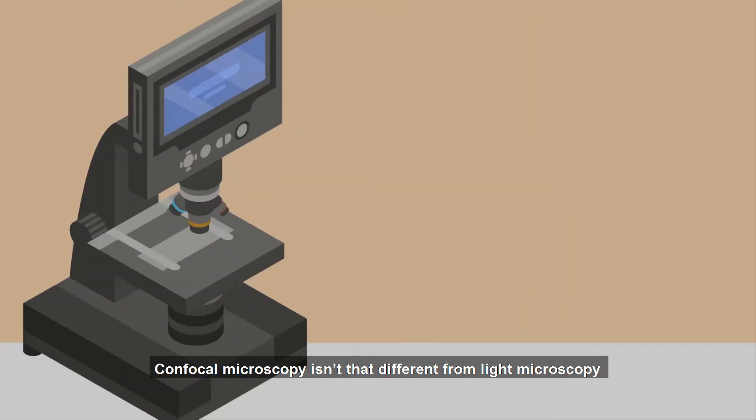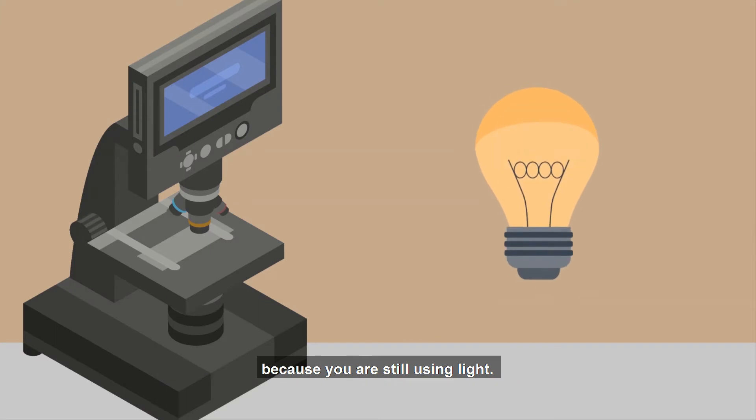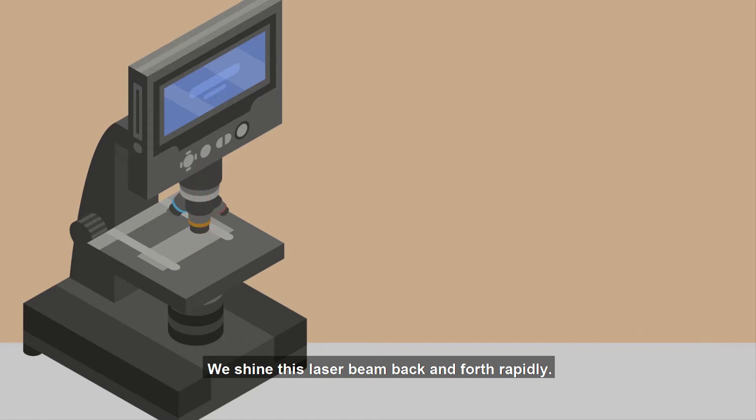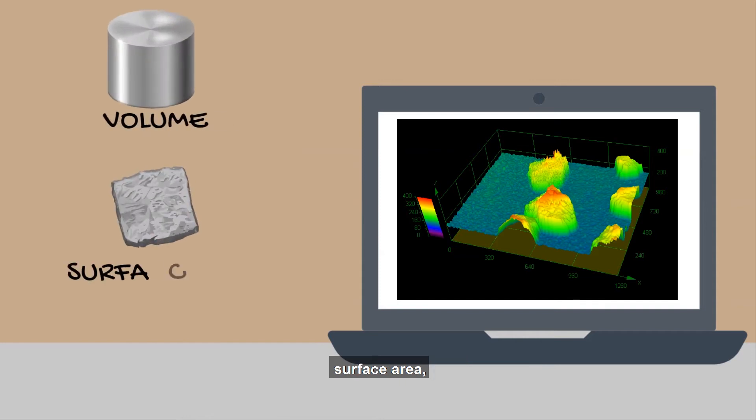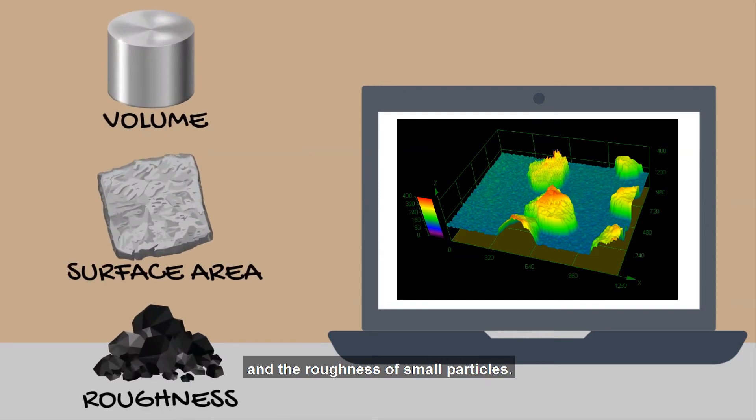Confocal microscopy isn't that different from light microscopy, because we are still using light, just in the form of a laser. We shine this laser beam back and forth rapidly. This scans the sample to create a 3D image to measure volume, surface area, and the roughness of small particles.